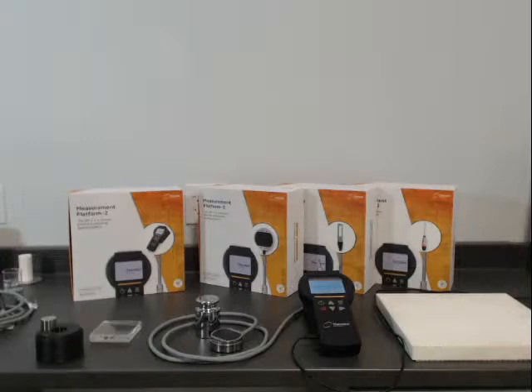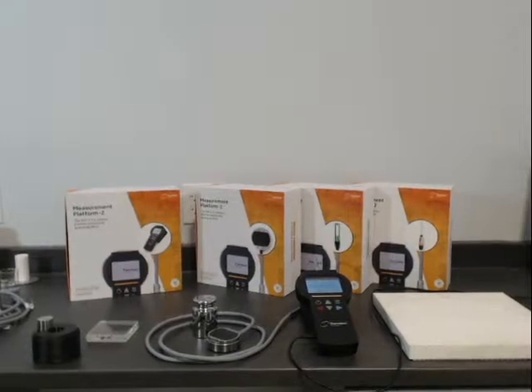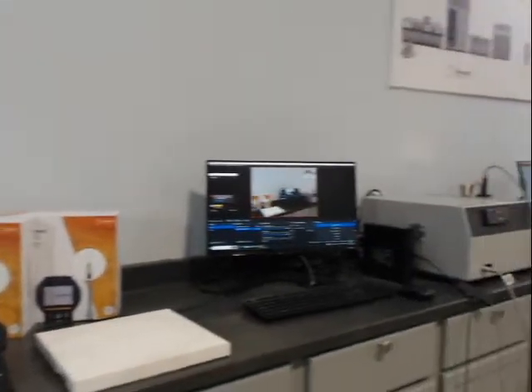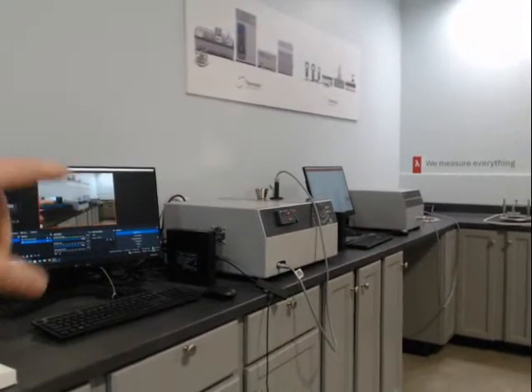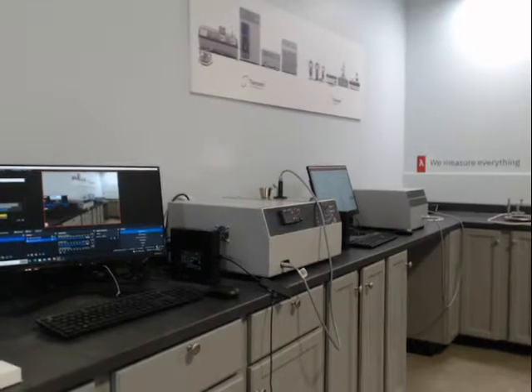Hello, welcome to the demonstration training corner. Today we will be talking about and demonstrating the MP2, which is the Measurement Platform 2. This is located in our demonstration corner, which I usually do a quick little overview. This is the THWL1 — we have these instruments set up permanently for training and demonstrations.